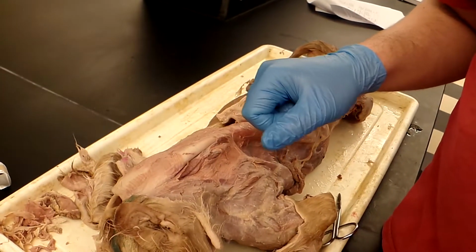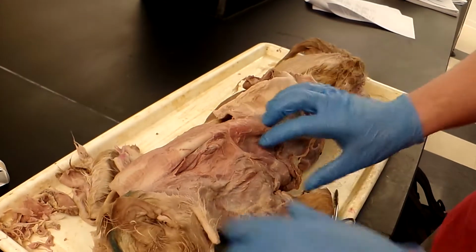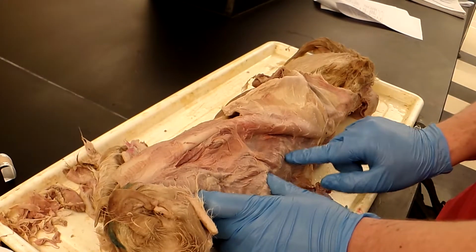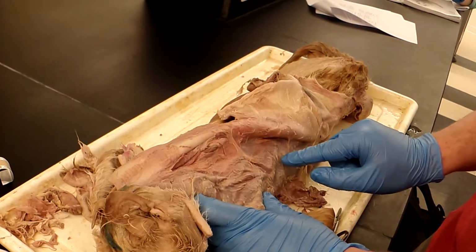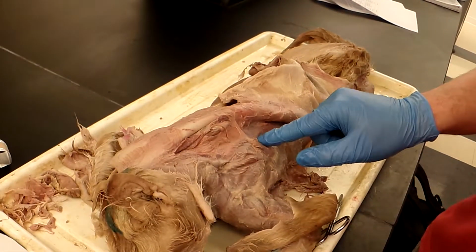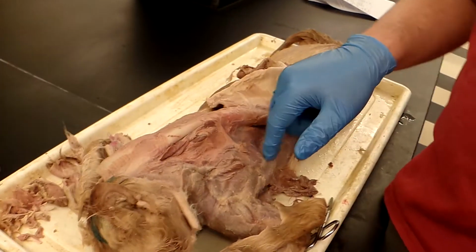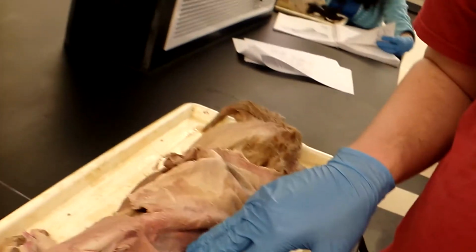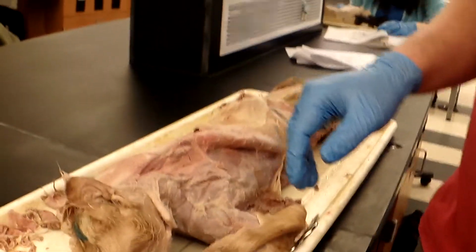Finally, the latissimus dorsi is located down here. It would be this one, right here, behind the leg. The origin is the spinous process of last thoracic and lumbar vertebrae. The insertion is the humerus, and the function is the retraction that elevates the humerus.